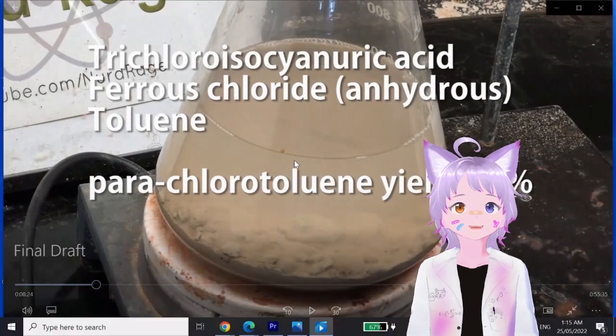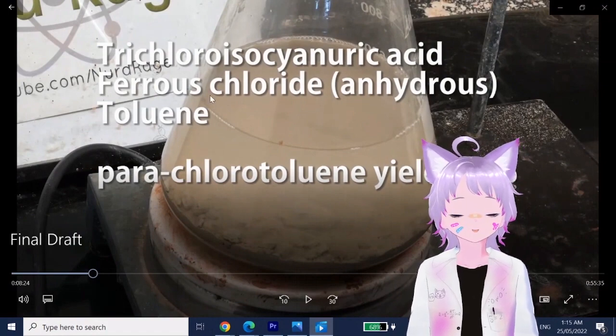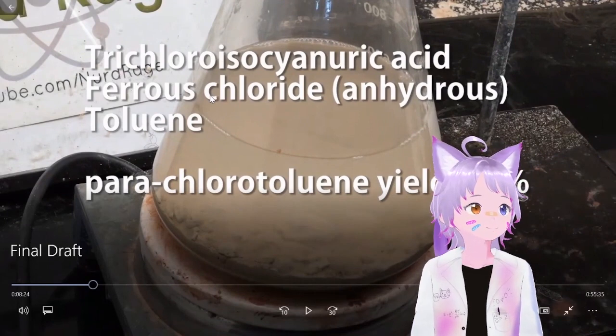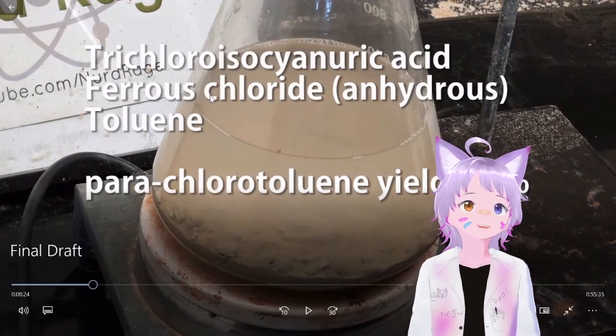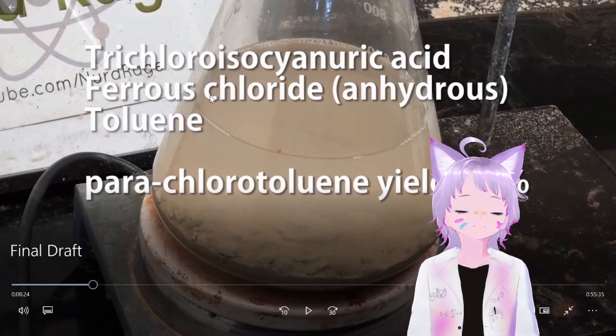Because ferrous chloride is the catalyst, we could say that the heat simply breaks down the TCCA and allows for the transfer of the chlorine to the toluene. And we end up with leftover TCCA, we have DCCA, and if there's the mono one, I don't know if that exists, and a whole bunch of ferrous chloride and toluene. We'd have to find a way to separate out all those cyanuric acid things.